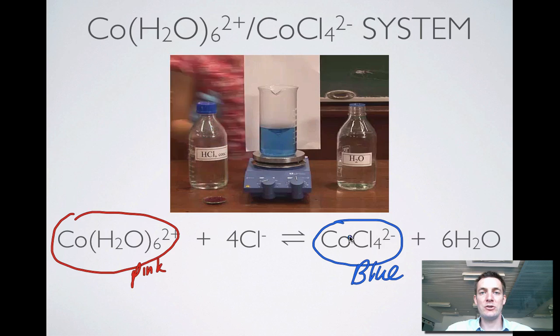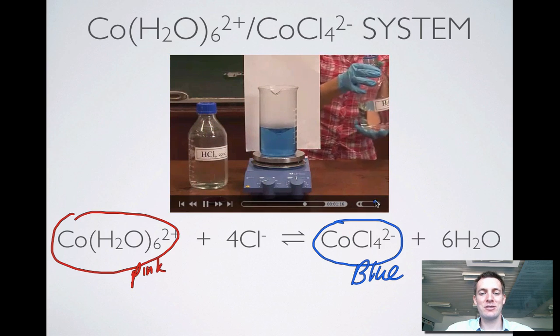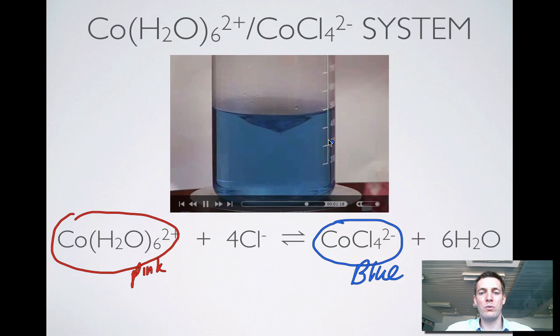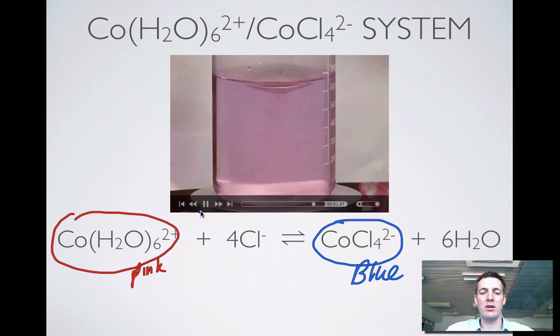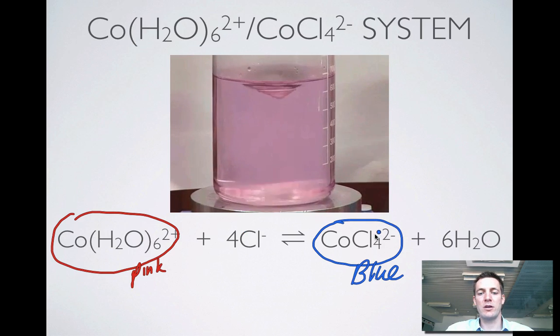And just to prove that this will keep working just about forever, if I add more water to it again. So here comes the water being added and it's turning pink. Again, so products go, we add products, we go left, add reactants, we go right.